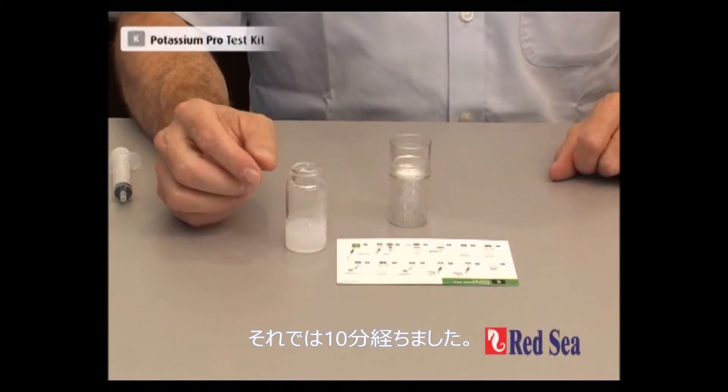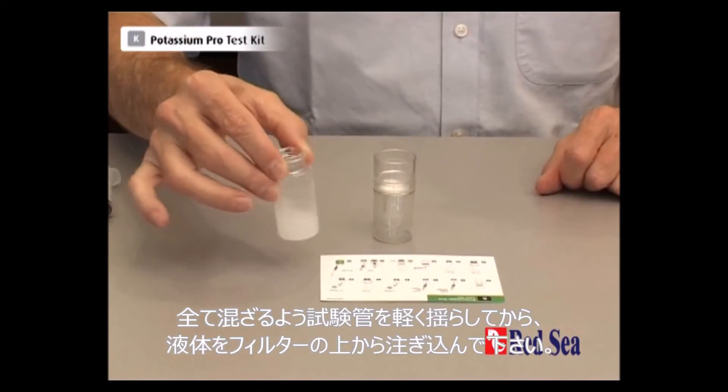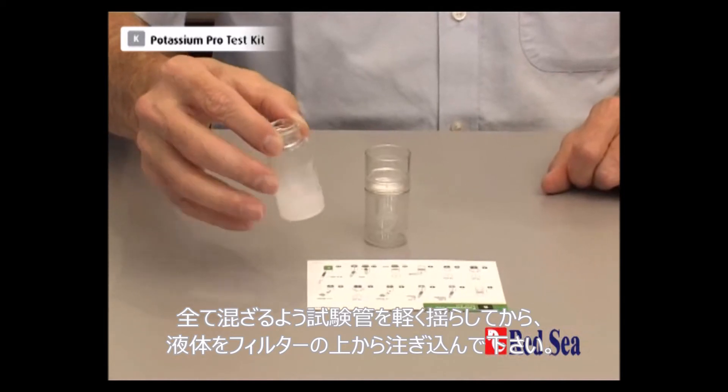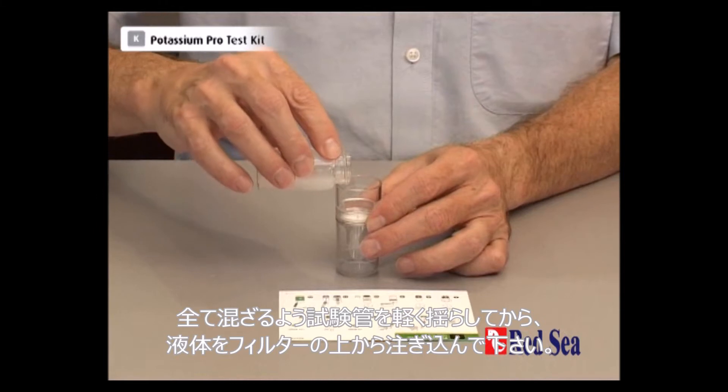Okay, 10 minutes has passed. So we just give our vial a little swirl to make sure everything is in solution and we pour the liquid into the top of our filter unit.